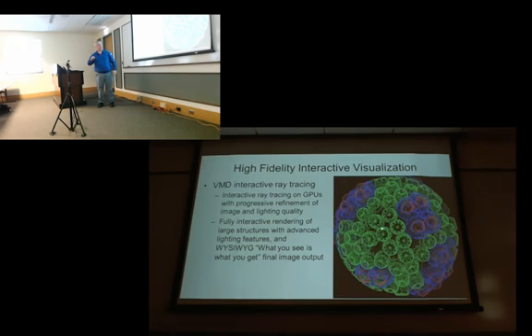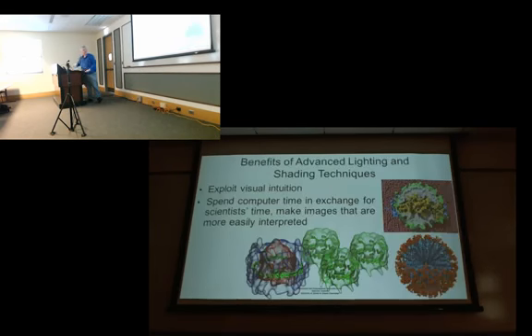That's why you're able to look right in, and you see the boundaries of those little LH2 rings, but you can look inside very easily. It doesn't obscure the interior structure as much. If I go back to the previous one, that's the same shader being used here. That's why when you look here, it's like there's nothing in the way at all, but you do see the boundary just around the edge.